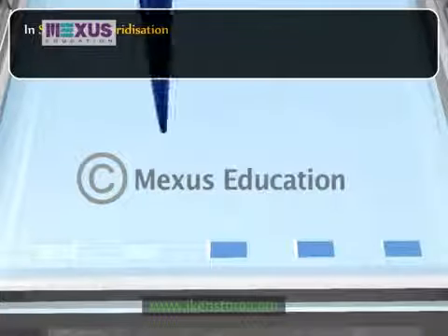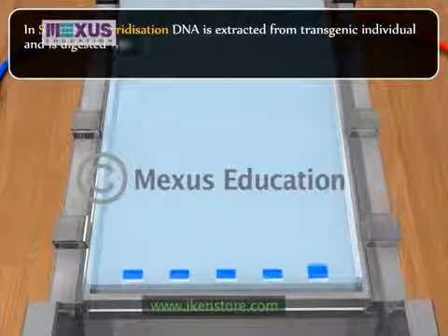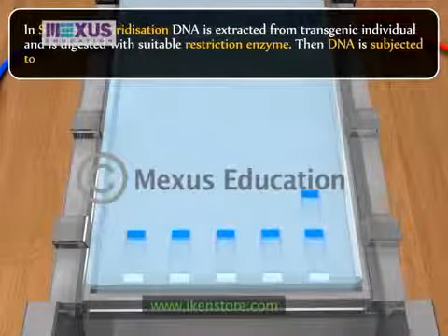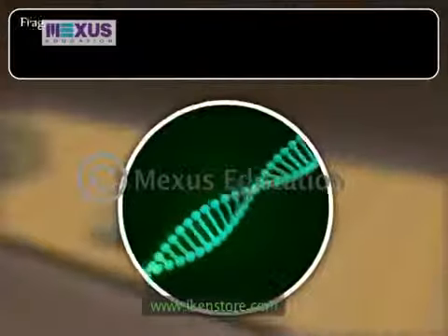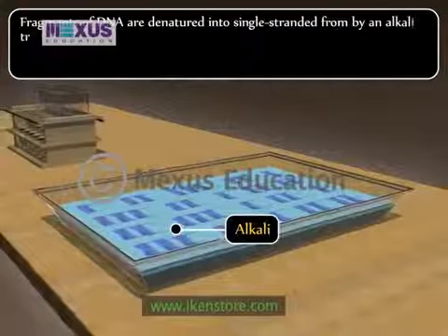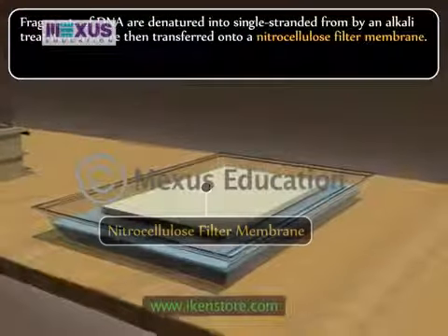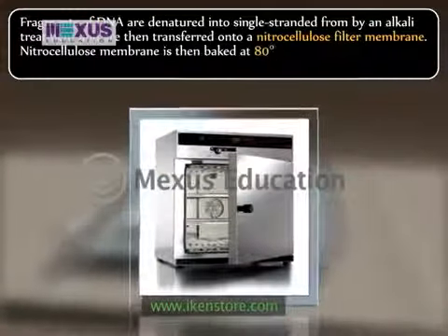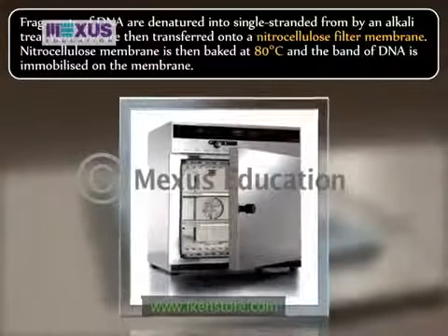In this process, the DNA is extracted from a transgenic individual and is digested with suitable restriction enzyme. Then, DNA is subjected to agarose gel electrophoresis. Fragments of DNA are denatured into single-stranded form by an alkali treatment and are then transferred onto a nitrocellulose filter membrane. Nitrocellulose membrane is then baked at 80 degrees Celsius and the band of DNA is immobilized on the membrane.